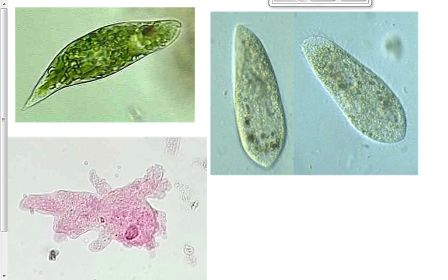And this down here in the bottom left is the amoeba. Your amoeba will look generally like this, but not have this exact shape because amoebas change their shape all the time. They're a blob. They surround their food and then just engulf it. And that's what these are kind of doing. Like this here would close around a piece of food and engulf it, and it's called phagocytosis. To engulf something and eat it. All right, those are the other three things you're looking at. Everybody with me? If you're having trouble getting something focused, let me know and I'll come and help you. That's no problem.